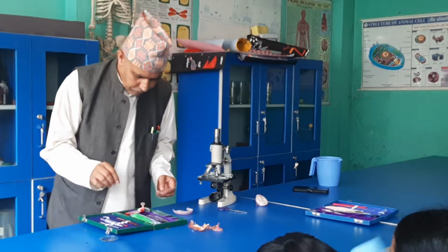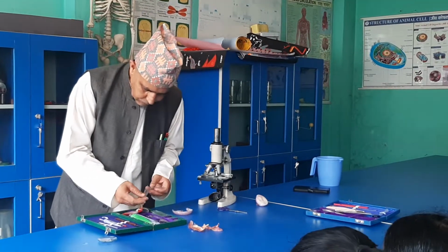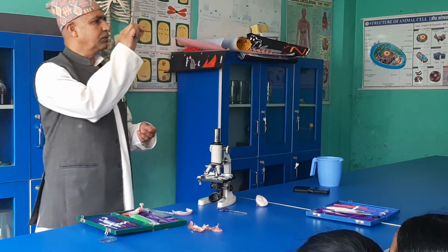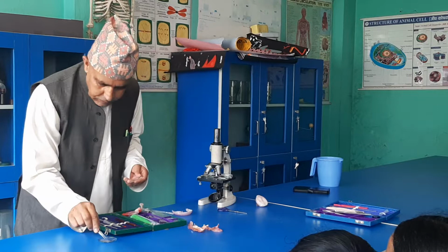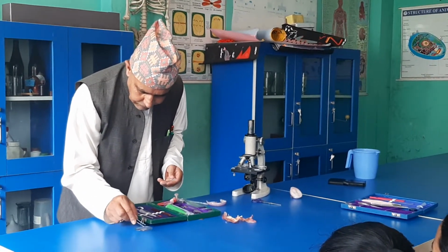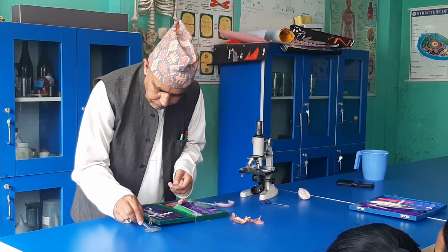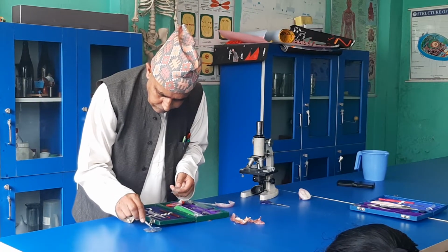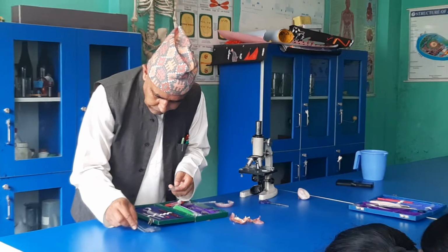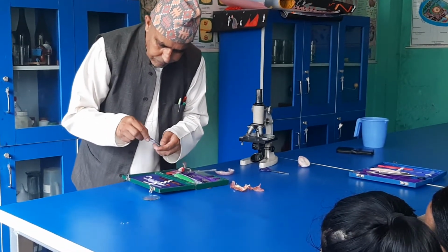Okay, so afterwards what we have to do? We need one forceps. Here is one forceps. What is the forceps? To take the small piece and place it in. We have to choose the best one and then place it in this slide.